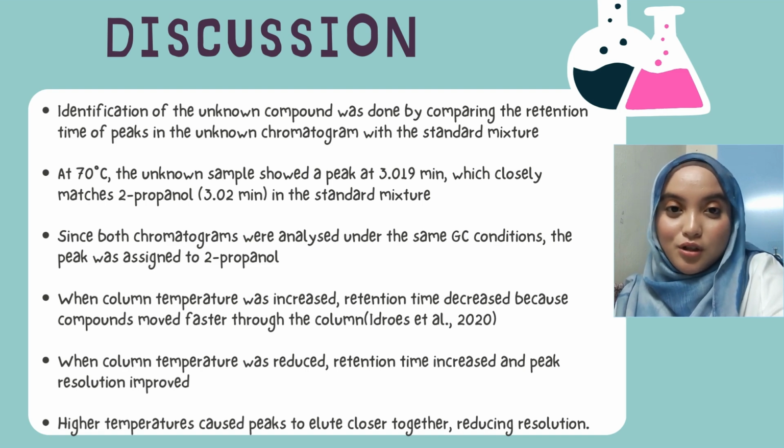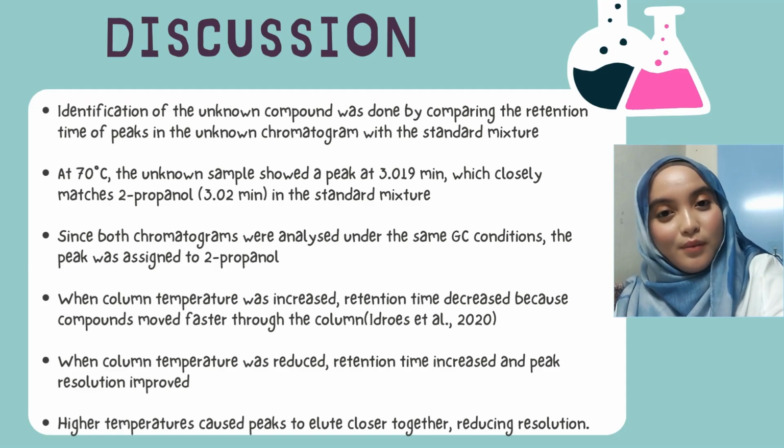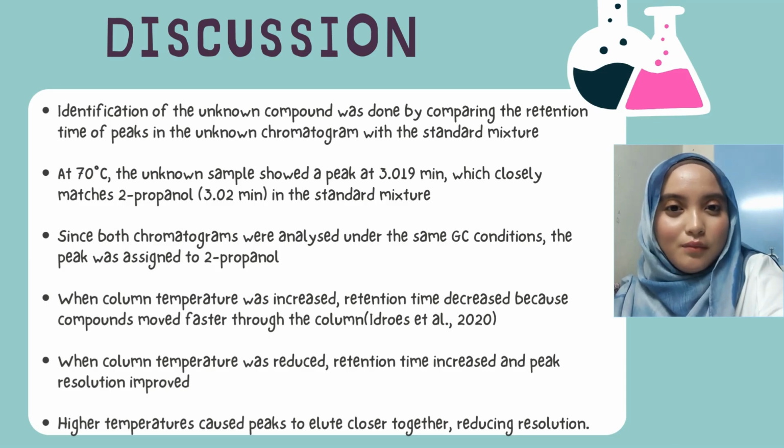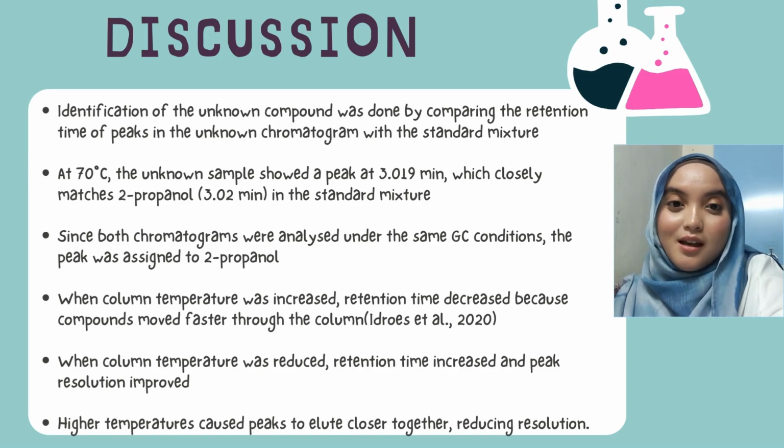When the column temperature was increased, the retention time decreased because the compounds traveled faster through the column. However, when the column temperature was reduced, the retention time increased and the peaks were better separated, resulting in improved resolution. At higher temperature, peaks elute closer together, which reduced peak resolution.